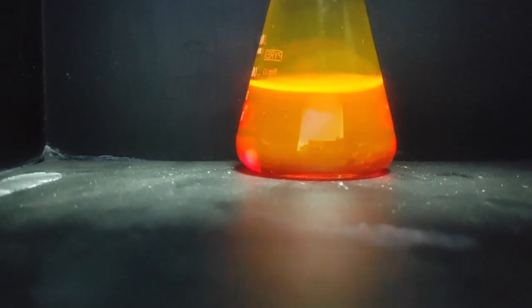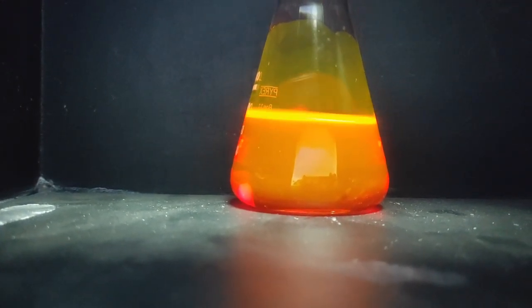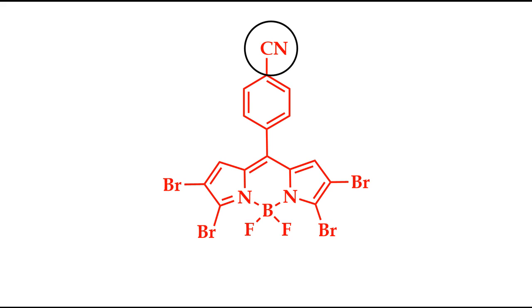In this video, I will share my journey in developing a material that enables the detection and differentiation of amine gases using a smartphone. To achieve this goal, I synthesized and tested various BODIPY derivatives with bromine atoms at the alpha position. Among these structures, the compound I named TolBodipy yielded the best results.